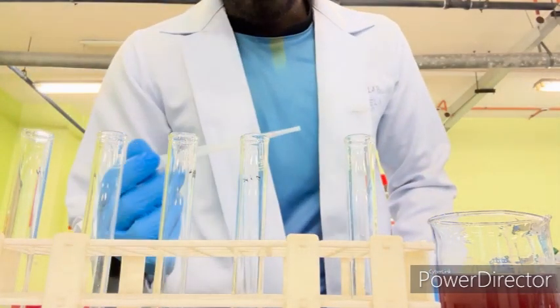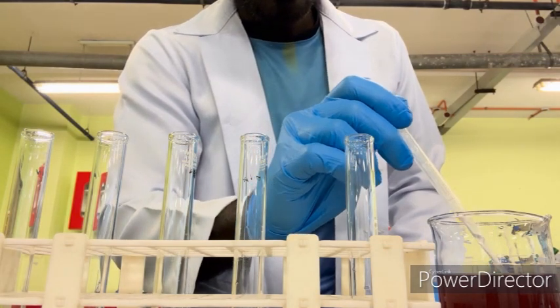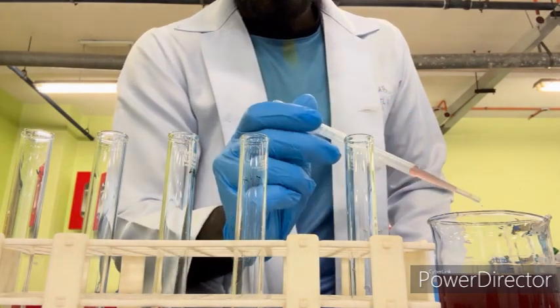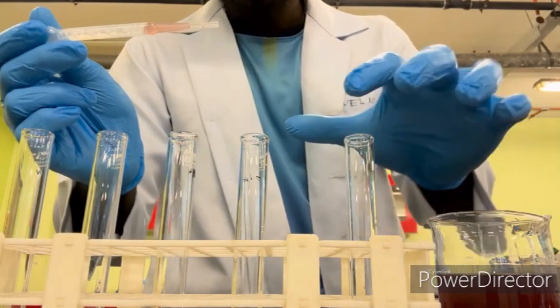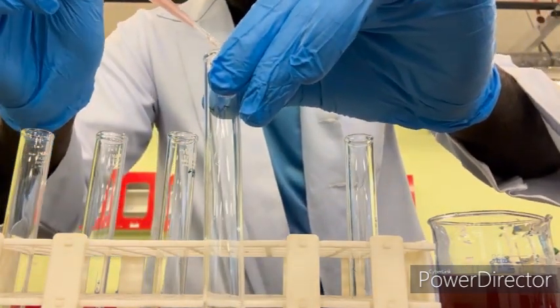Okay, now for second, when you add to 0.1 m acetic acid. So this is a 0.1 m acetic acid. Okay, going to add a few drops here.